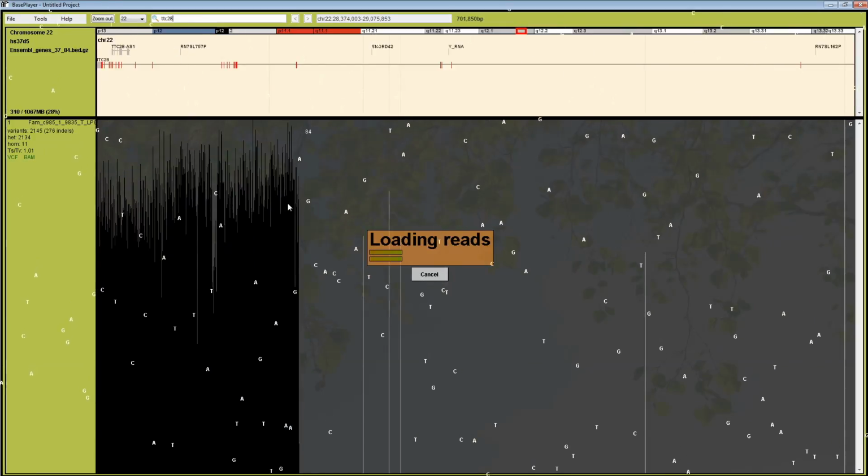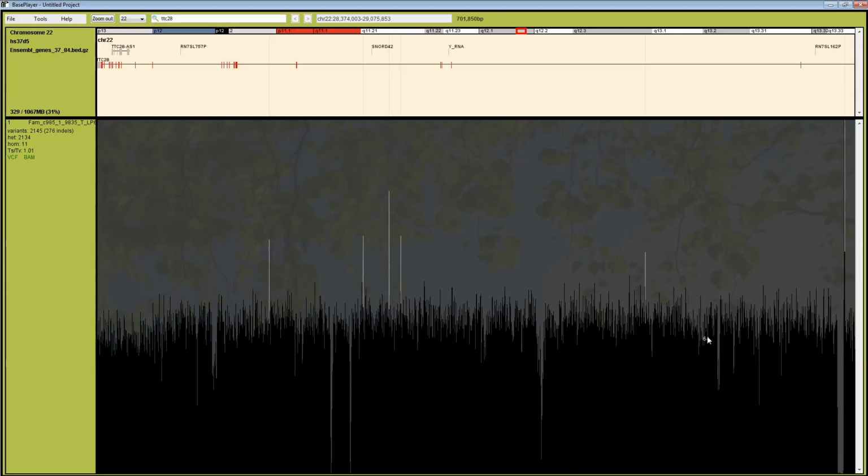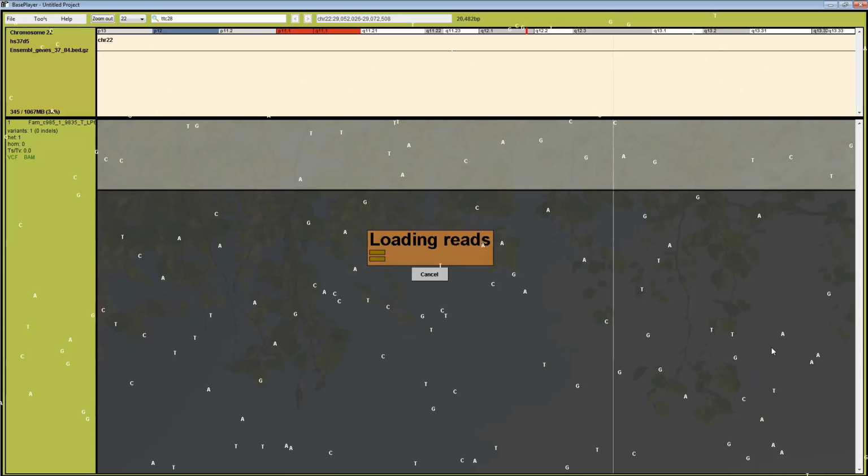And in this study, we analyzed the line1 element in the first intron of the TTC28 gene. So, okay, you can see here the whole genome sequencing data from this locus, and up here we have the TTC28 gene and its exons. Here we have a gap in the coverages, which is our line1 element, so let's zoom into that.